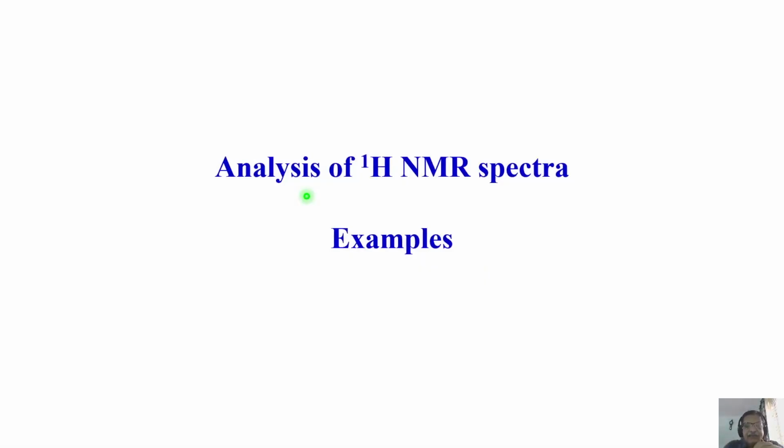In the last couple of classes, we discussed varieties of NMR parameters like chemical shifts, scalar coupling, coupling strengths, and multiplicity pattern. And also, I introduced to you the Pople nomenclature where strong and weak coupling spins can be defined by the Roman alphabets. For example, a two weakly coupled spin system, we refer to as an AX spin system. If it is strongly coupled, we denote it as AB. Similarly, for more coupled spin systems like 3 or 4, we represented them by different Pople nomenclature.